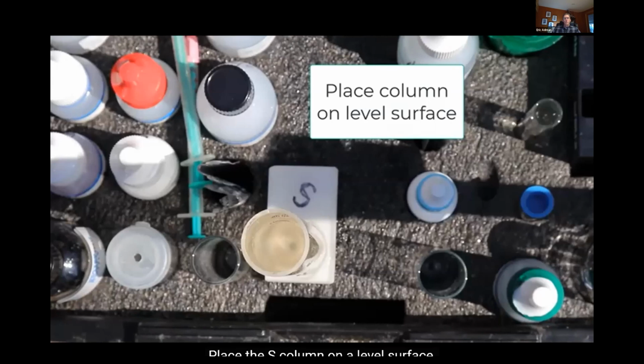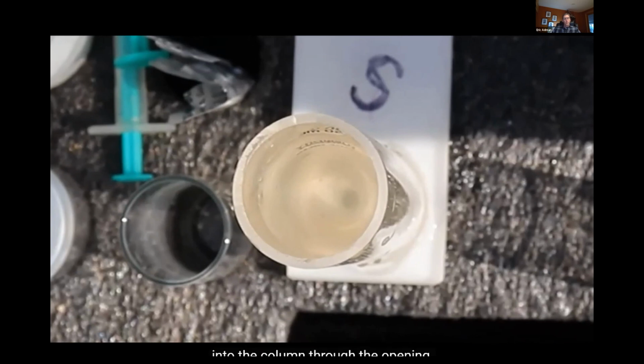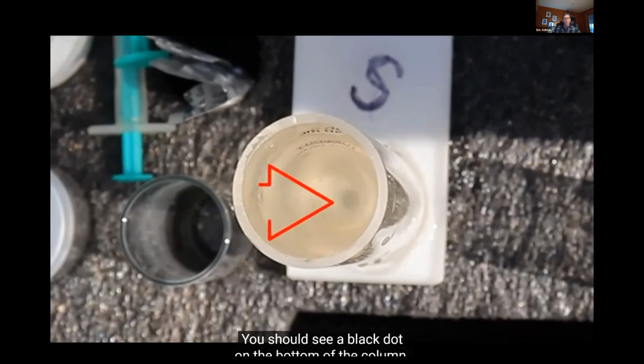Place the S column on a level surface, like in the center of your kit. Position yourself so that you can look down into the column through the opening, preferably from a distance of only about 6 inches. You should see a black dot on the bottom of the column.